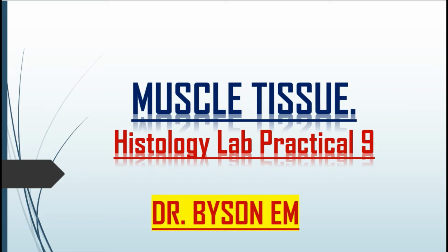In this lesson, we're going to look at histology, lab practical number 9, which is muscle tissue. Let's move on and look at the objectives of this lab. What are we looking at?